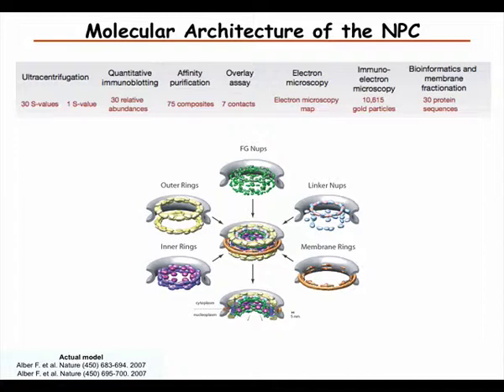So now one example where this kind of information, in addition to a lot of other types of information, was used to make a structure was this work that comes out of Rockefeller University, also from Mike Rout and Brian Chait's labs, where they collected all sorts of different information, and then used these different kinds of information as constraints to make a structure.